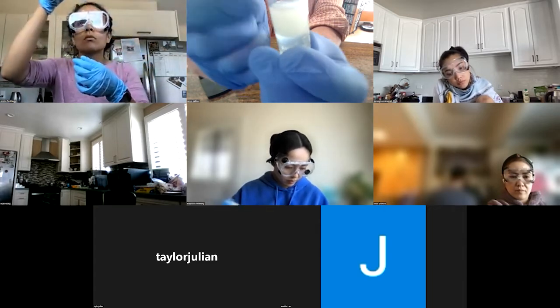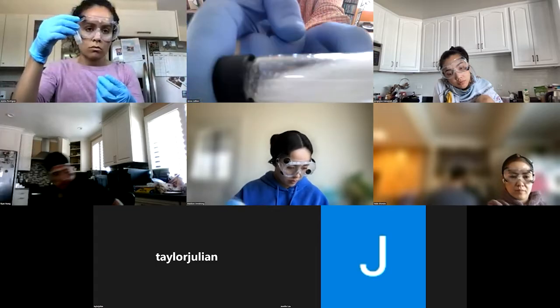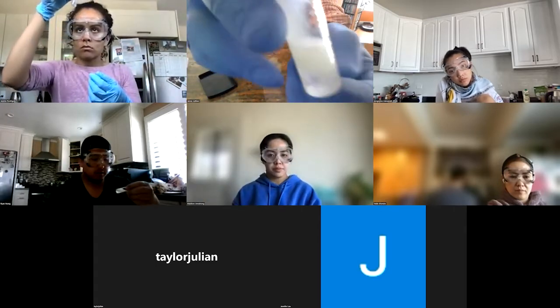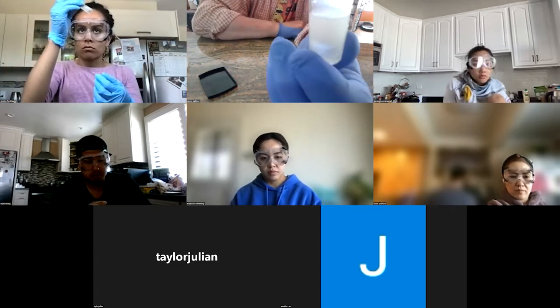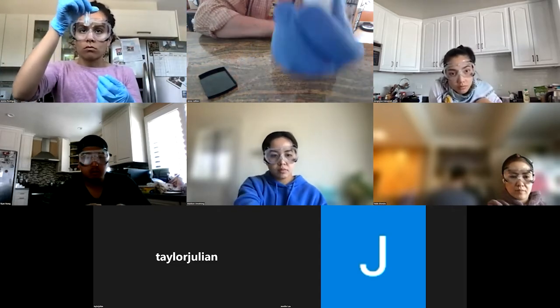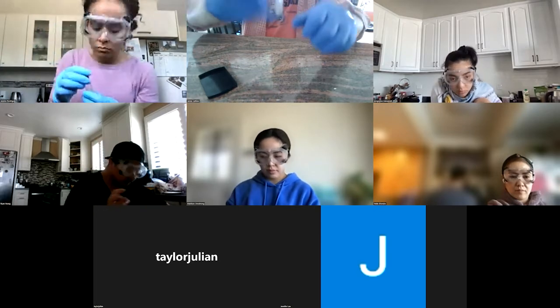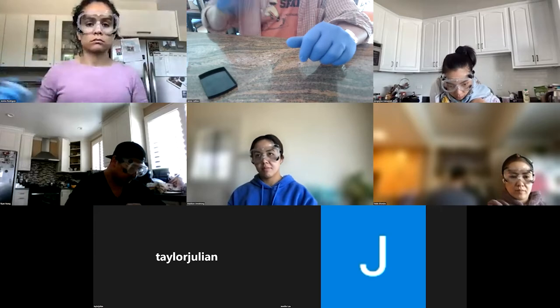It's not really a solid yet, but there is a reaction starting to occur. Because you remember before the oil was clear, now it's not. So we're forming a new substance in there. So give it another good shake.